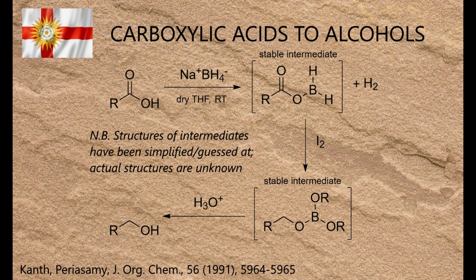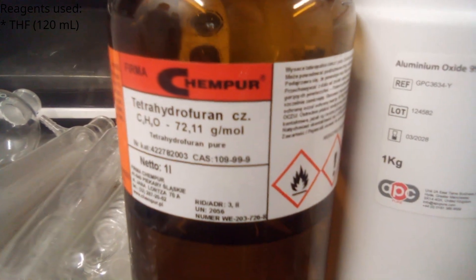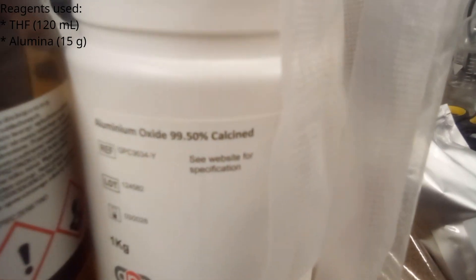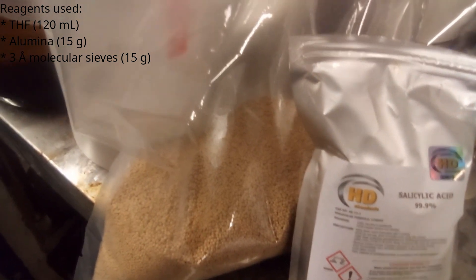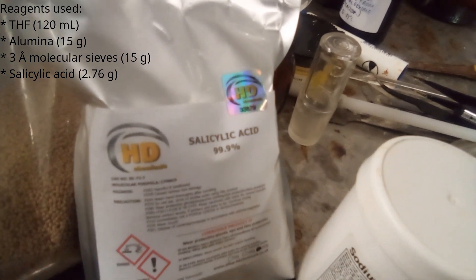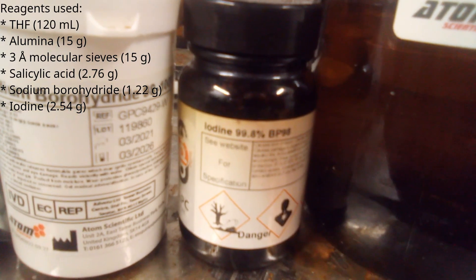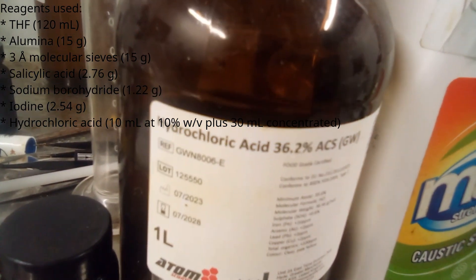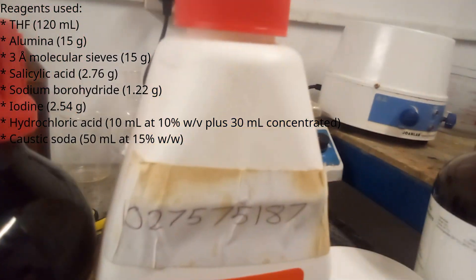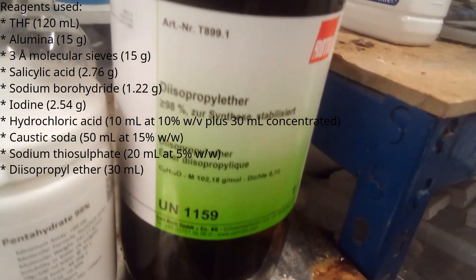I'll spoil the ending for you right now: it does actually work. If it didn't, I'd not have made such a long video about it. The reagents used were THF, alumina, 3-angstrom molecular sieves, salicylic acid, sodium borohydride, iodine, hydrochloric acid, caustic soda, sodium thiosulfate, and diisopropyl ether.